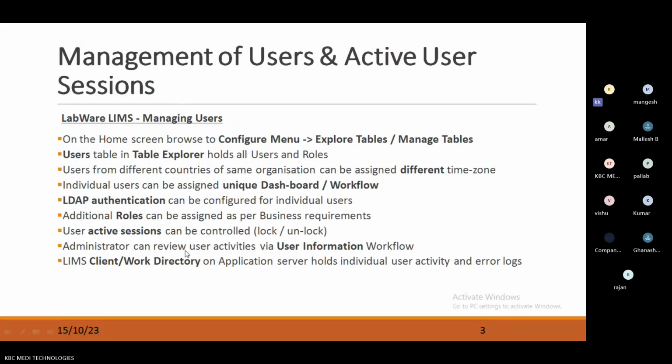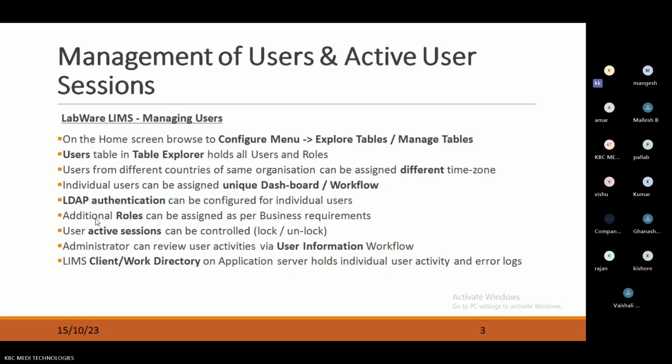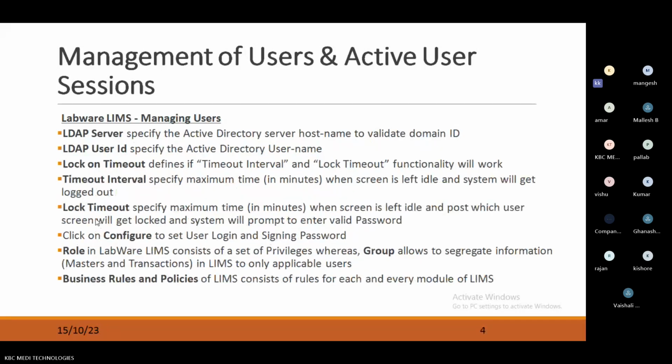Once you open the user ID, you need to enter the username and user ID and how you want to keep password controls. Do you want to keep LDAP server control or manual password updation? Do you want to keep any additional roles for any one user? How are you going to keep active sessions? How many times can a user enter a wrong password? How is the system going to control that? All those points I can keep through this LIMS application.